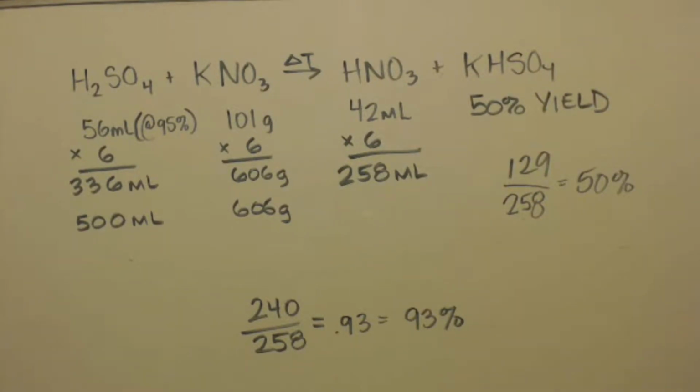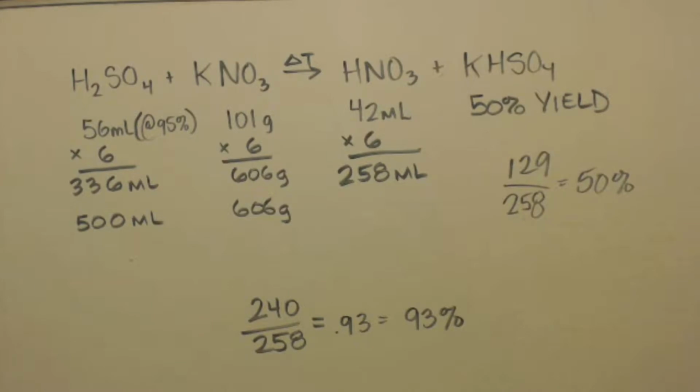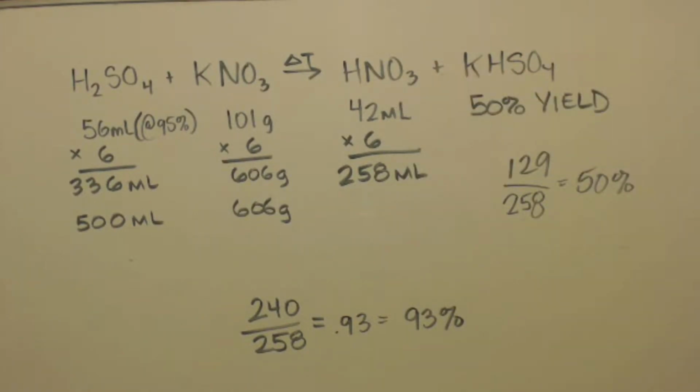I don't like it. The other thing is at the end of the distillation, you have this big rock of salt in there that's soggy as heck. You can't distill it to dryness. Let's say you do this reaction. Now you have all this in there. You have the salt and it's soaked with HNO3. How are you going to get all the HNO3? You can't get it all out, because if you do, you'll end up cracking your glass.